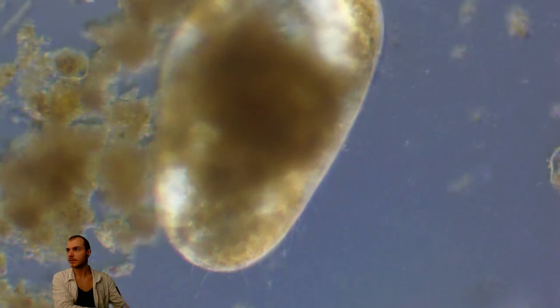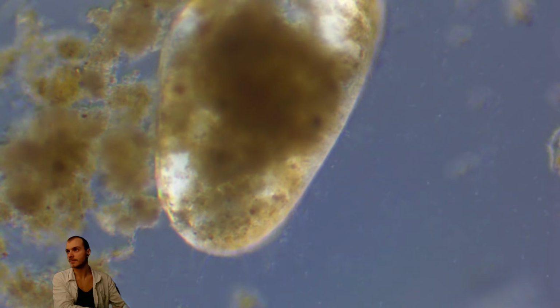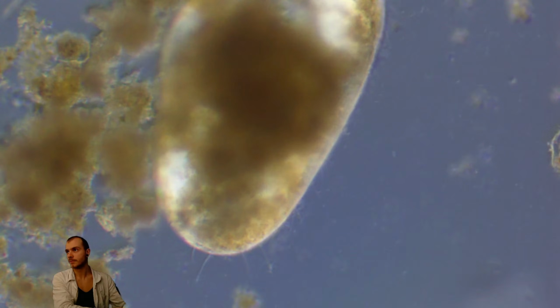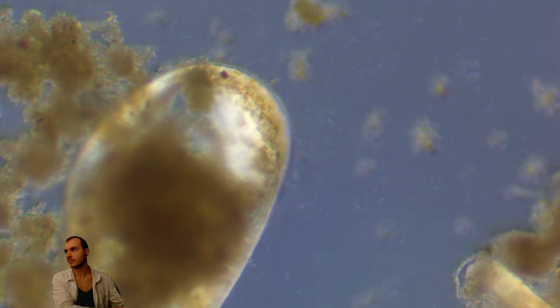Yeah, this is surely from an ostracod. You can even see the hairy structures here. You can see those bacteria which feed from the body of the ostracod.